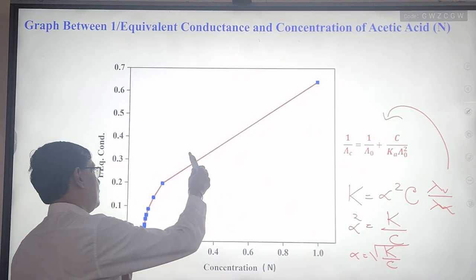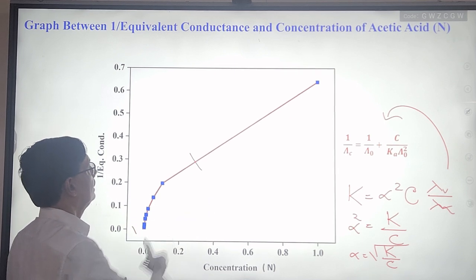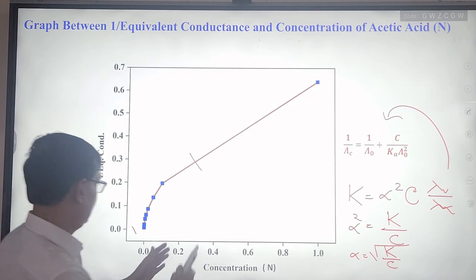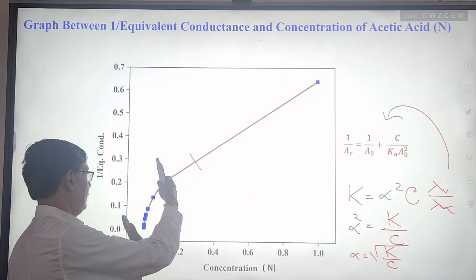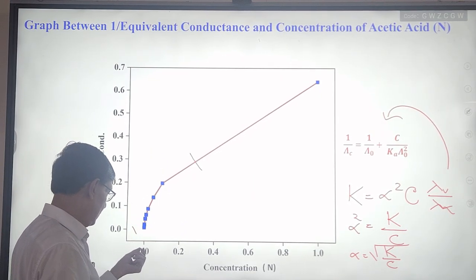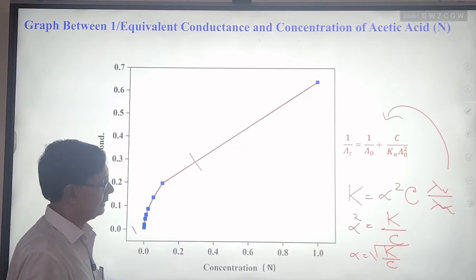We can solve up to this part also. Maybe this slide may be different. I am not getting a 100% straight line, because there is a large gap between these points. So you can plot this part also. Let us see what type of curve is obtained: 0.1, 0.2, 0.0001 like that.